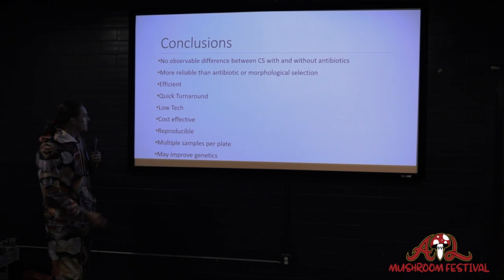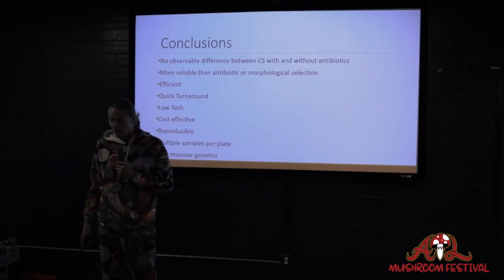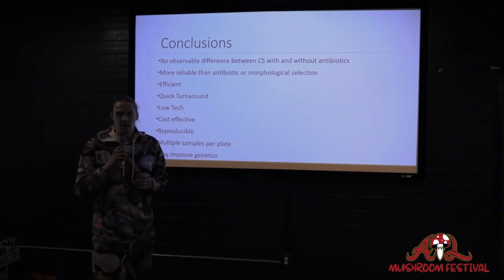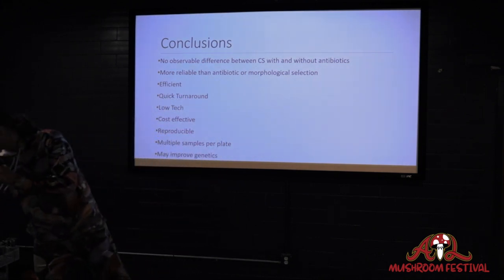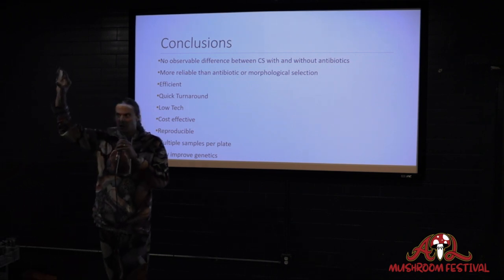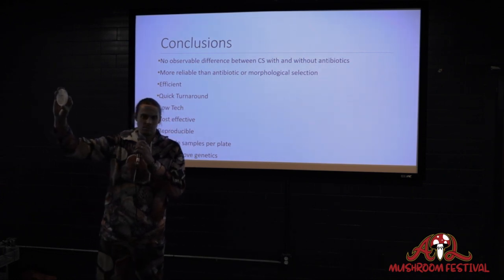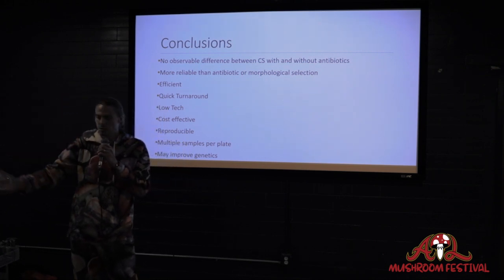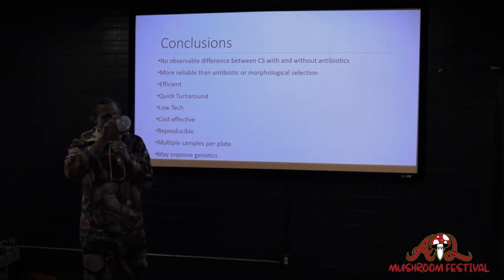So the technique is efficient. It's got a quick turnaround. It's very simple to perform. All you need is 2 agar plates. And honestly, what's very interesting is I've played with this technique enough that I am able to perform it with 1 agar plate. So if you take an agar plate and you split it up into 4s, like I was showing you in the video, if you go to the spaces in between those pieces, you can cut out a triangle-shaped wedge. And so you can do a 4-cabin plate with 1 agar plate.